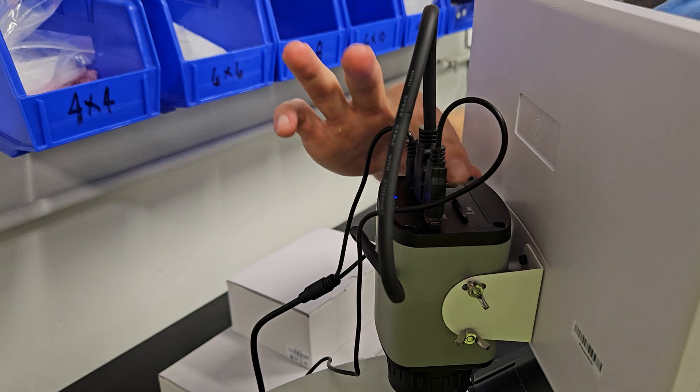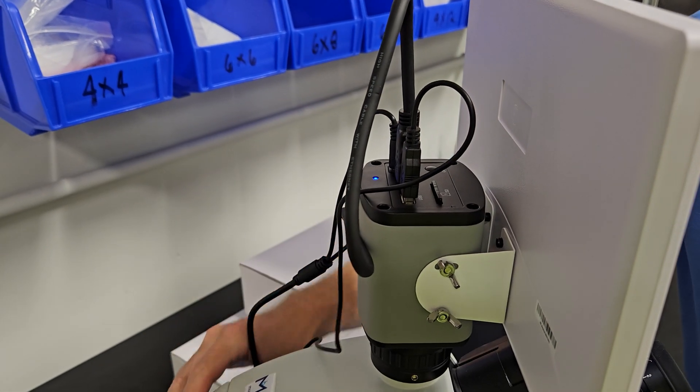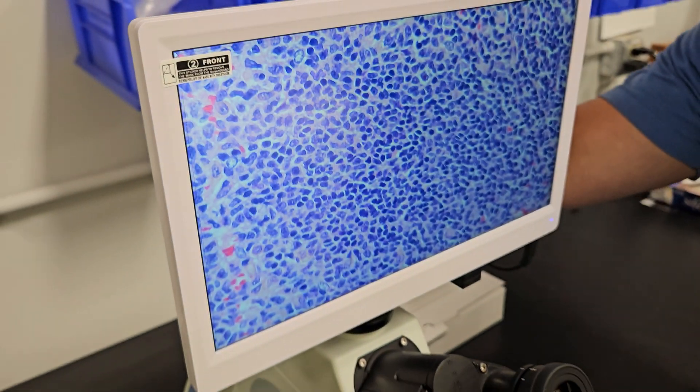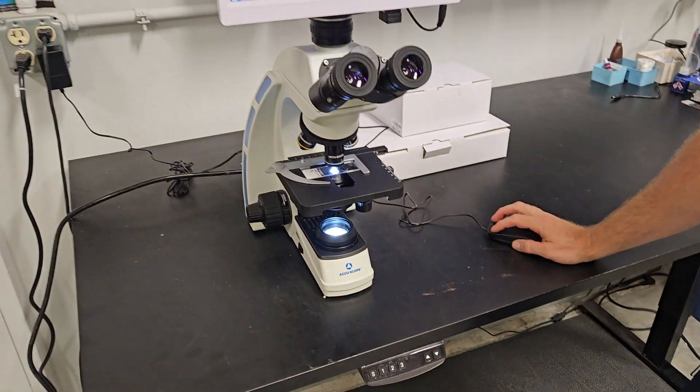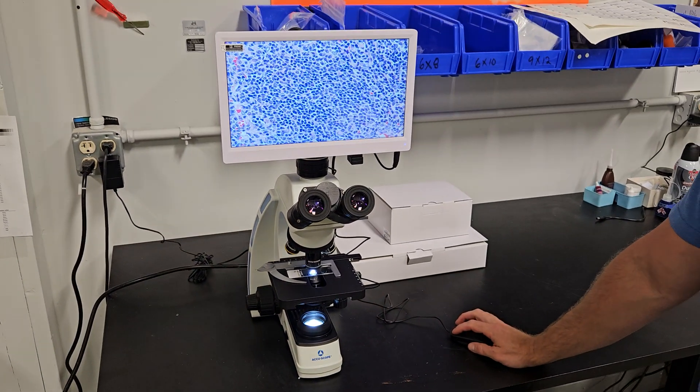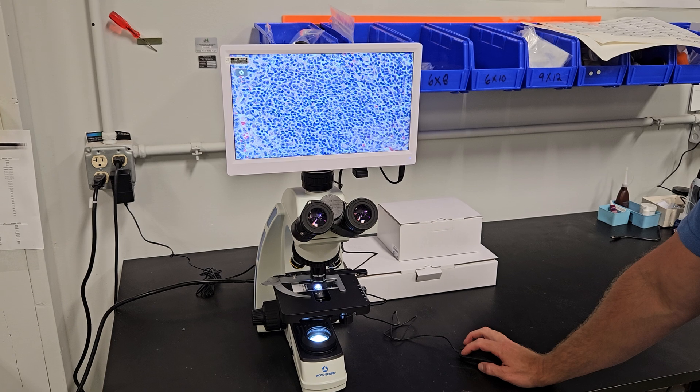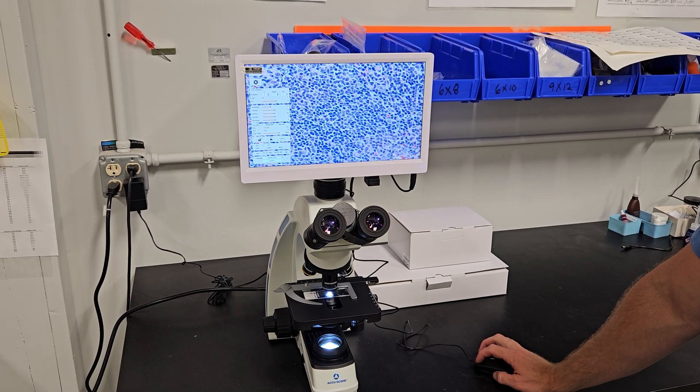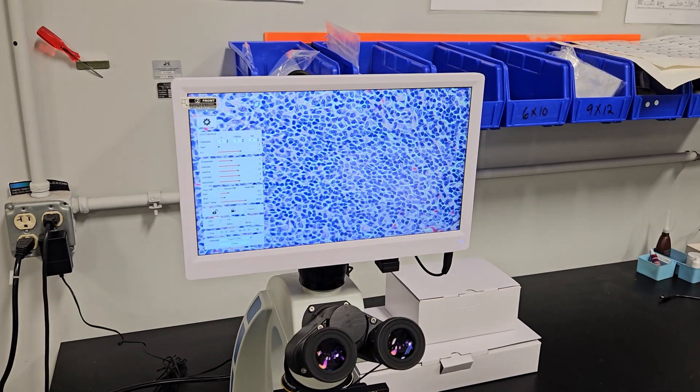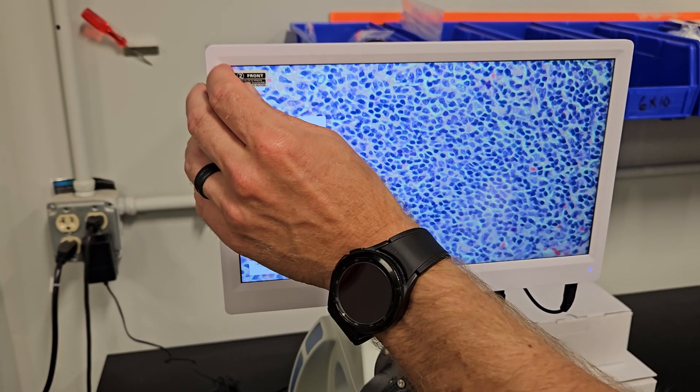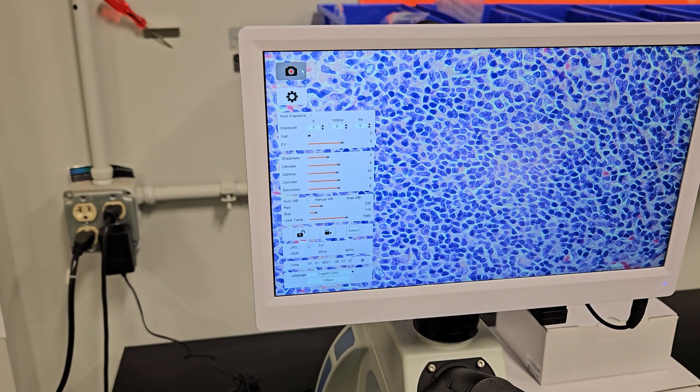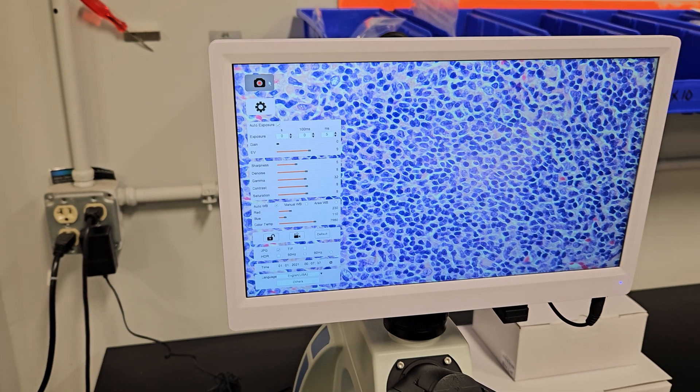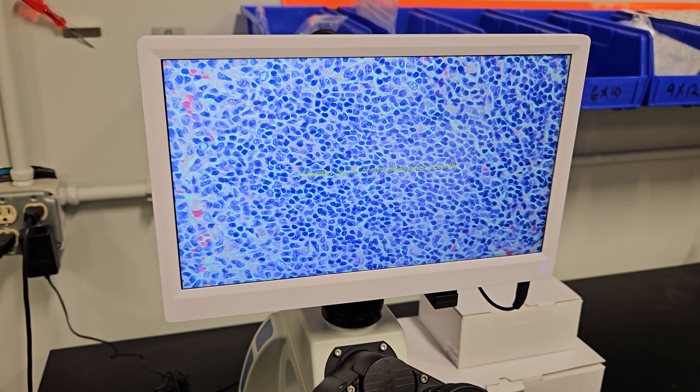You have an SD card in there if you want to capture images to the SD card and the mouse that's in there comes with the product and you can run a simplified version of the software. So you can check the settings and work the settings right here and then you can capture images. It's right behind this little protective sheet we have on because it's brand new. But you capture an image just like that by clicking that button it captures it to the SD card.